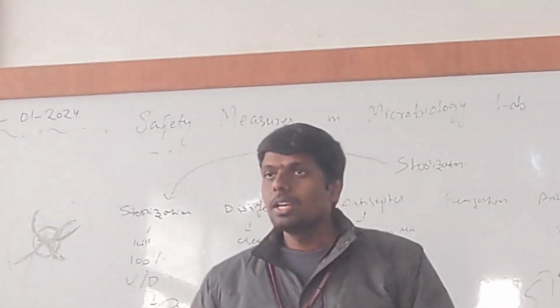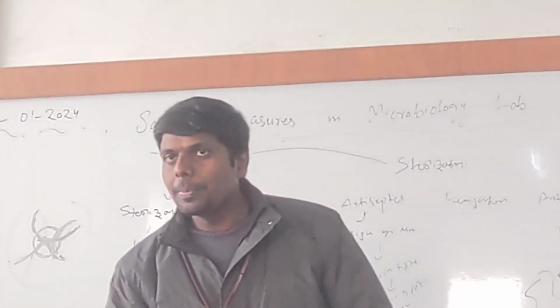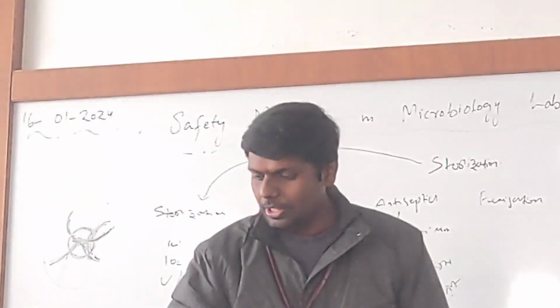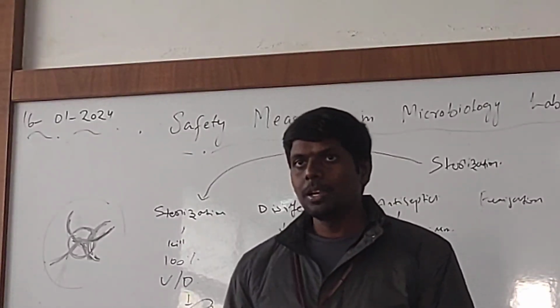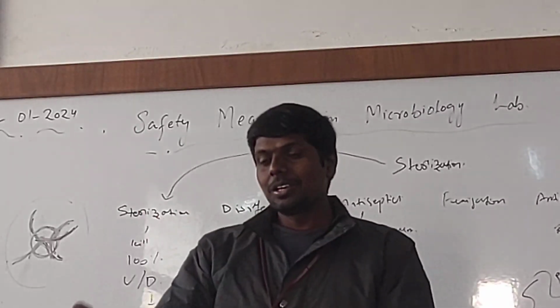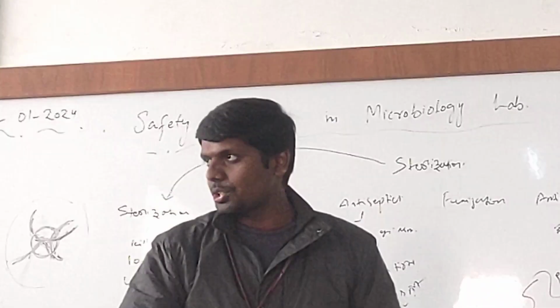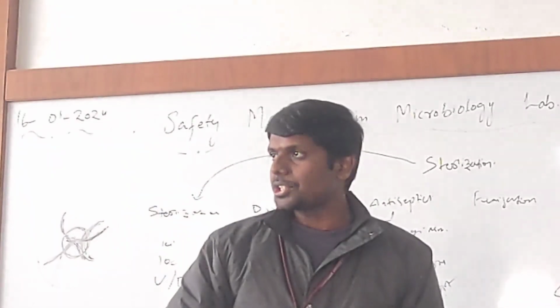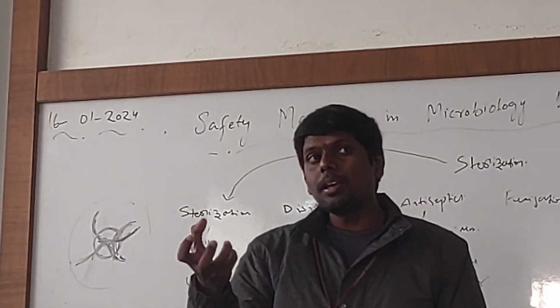Now, there is a chance of getting contamination. What does contamination mean? When I prepare this media, when I am talking here, some of my saliva particles might enter this dish, and since microbes are everywhere, even in my saliva, they will outgrow, and we will think that the patient has some infection. Since we collected a sample, it is a false positive. The patient doesn't have any infection, but I got some growth because of my contamination. To remove such contamination issues, we need to sterilize the media. The media should be clean.